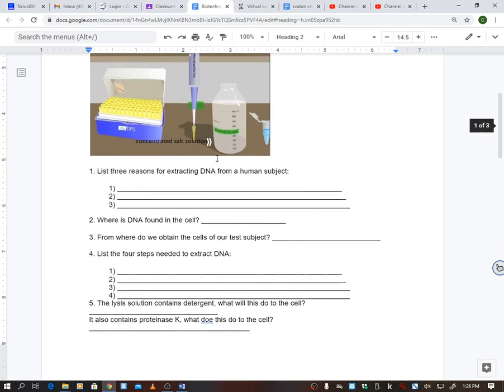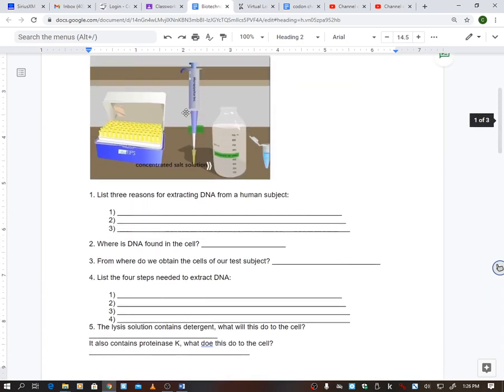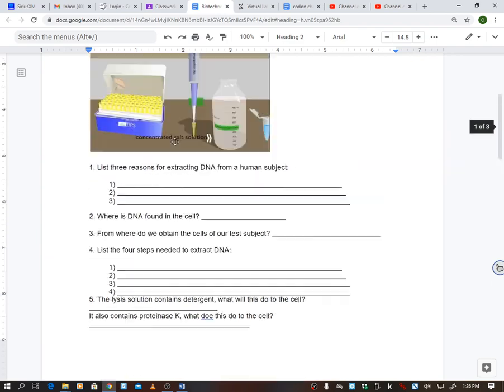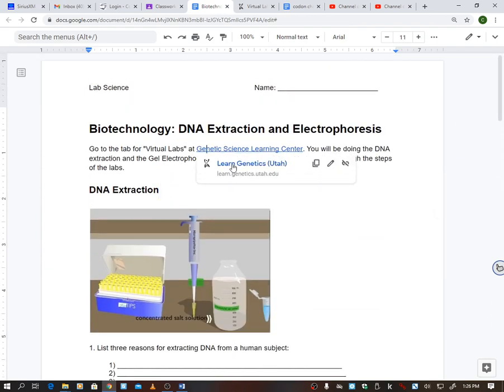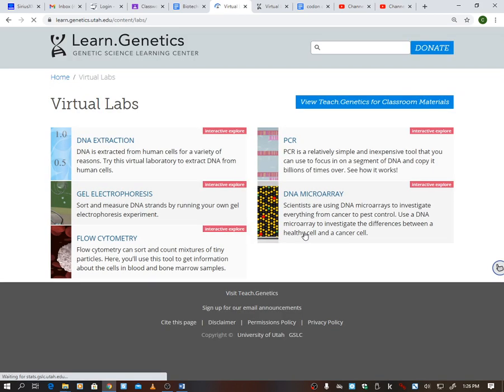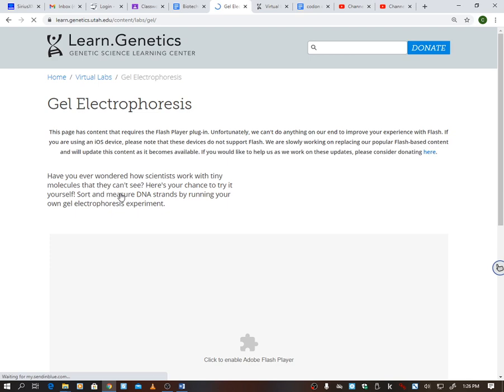Alright, so once you complete that, you are then going to do gel electrophoresis. So you're going to go back to the same place. You're going to go down to the virtual labs. And look, right here is gel electrophoresis.